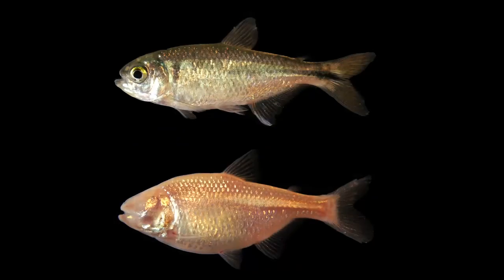Cavefish is emerging as a fantastic animal model to understand evolution and biomedical processes. We are now conducting biomedical investigation by using these traits as a parallel of human symptoms.